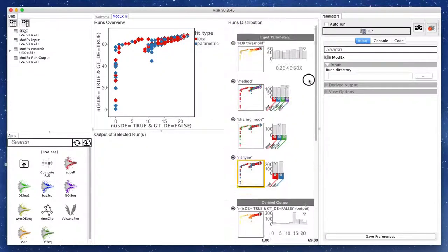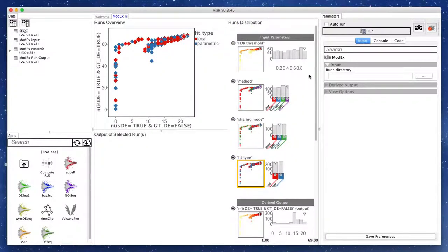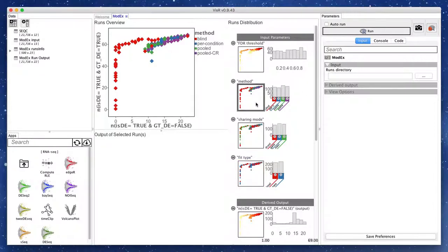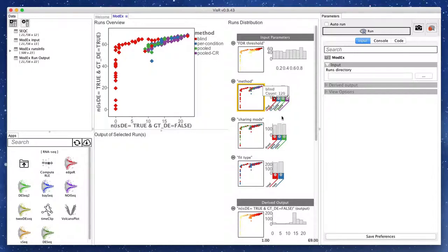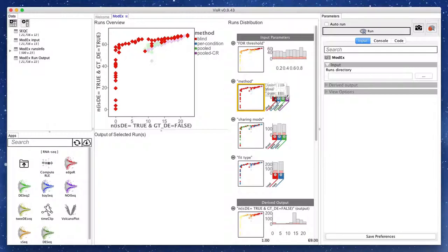The parameters as well as the derived output are shown under runs distribution view. Clicking on each parameter changes the runs point color to that parameter. We notice that almost all optimum runs on the Pareto set of the ROC plot use the blind value for the method parameter. So we use the filters to only select those runs.